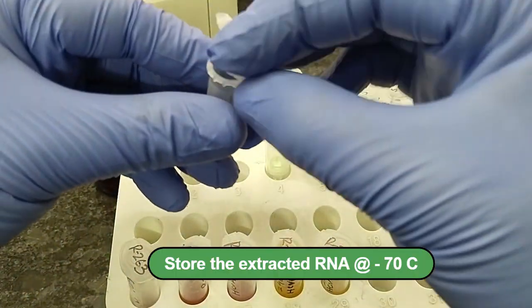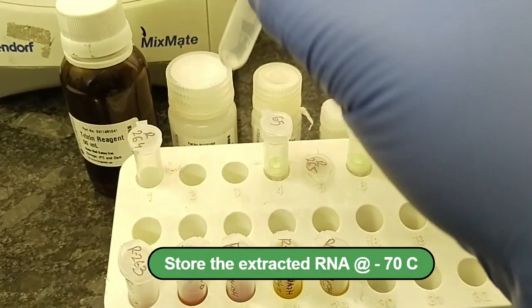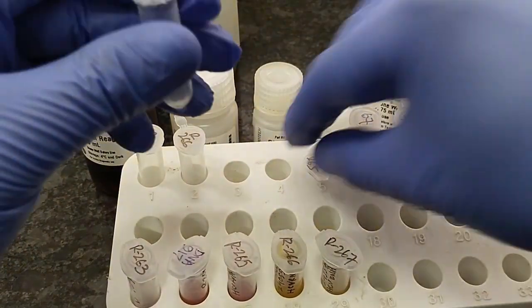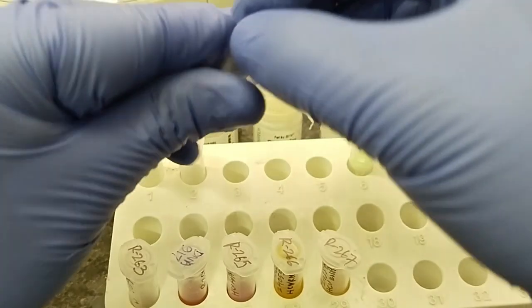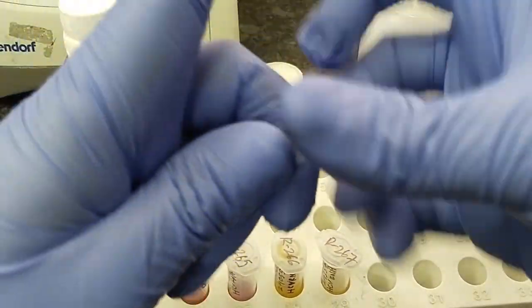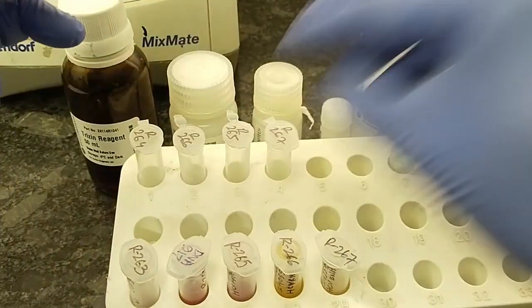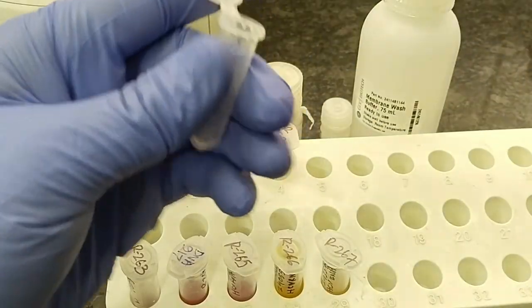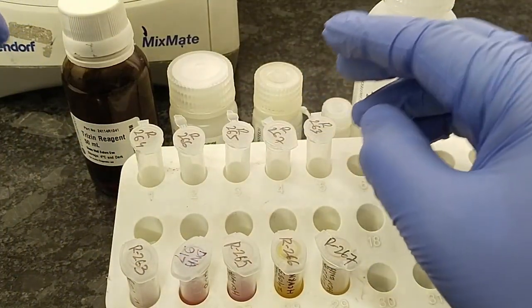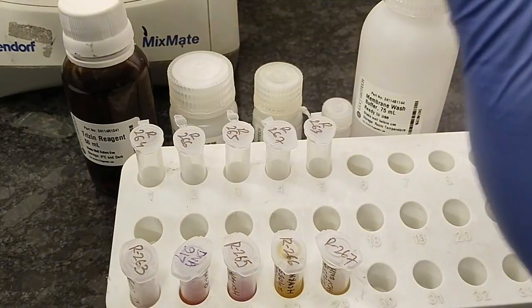It is stored at -70°C. Then we need to find out the viral load of the sample. Just discard the column. Now there is no need to use the column. So in this way our total RNA extraction process is completed.